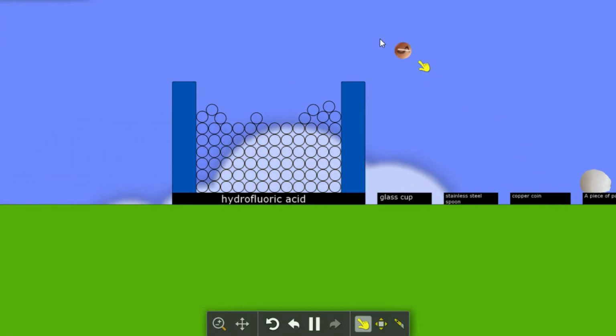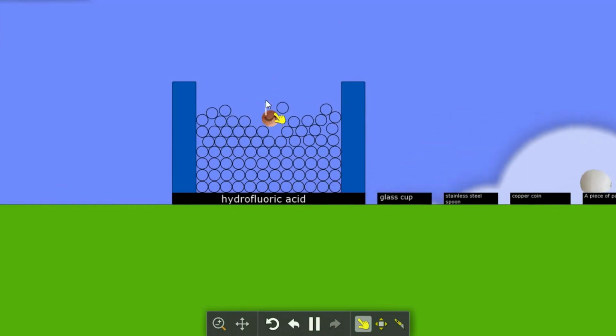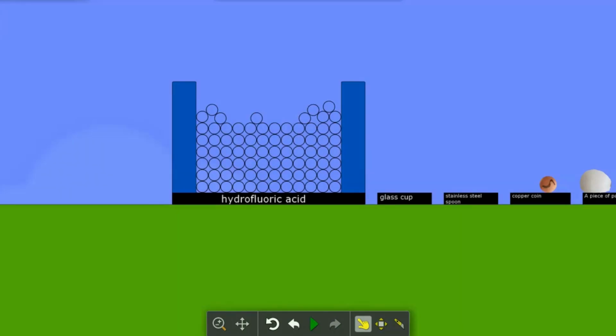The same will happen with a coin made of copper, which also does not dissolve in hydrofluoric acid. Copper also comes after hydrogen in the voltage series and forms a protective layer of oxide, CuO, on its surface, which prevents the reaction.